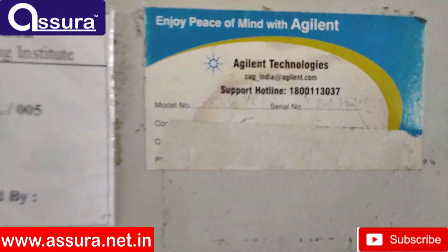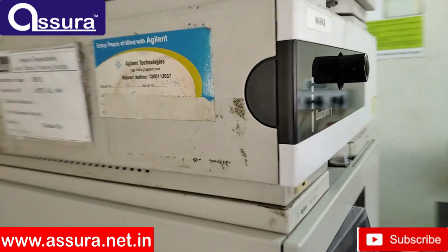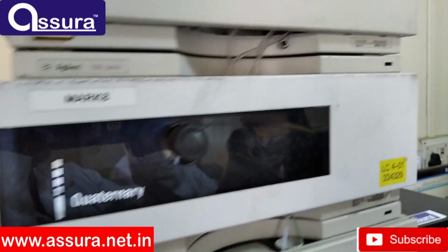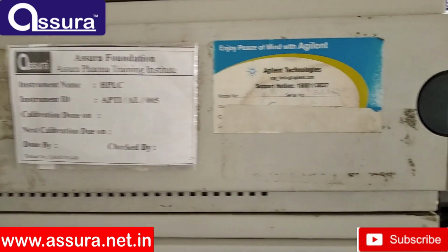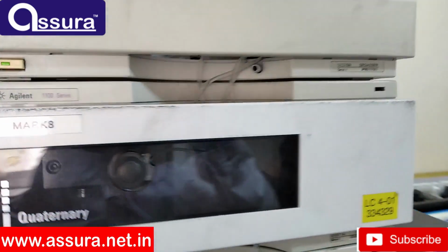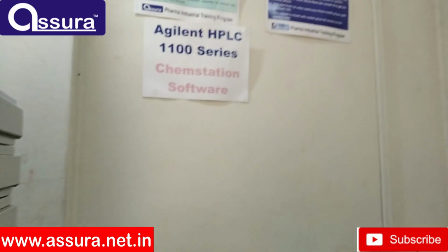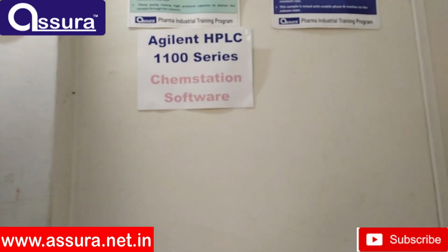Here we see the HPLC instrument. The main make of this HPLC instrument is Agilent. Agilent as well as Waters and Shimadzu HPLCs are used in the pharma industry. Here we see the HPLC instrument. The model number of this HPLC instrument is the 1100 series. There are also 1200 series available.